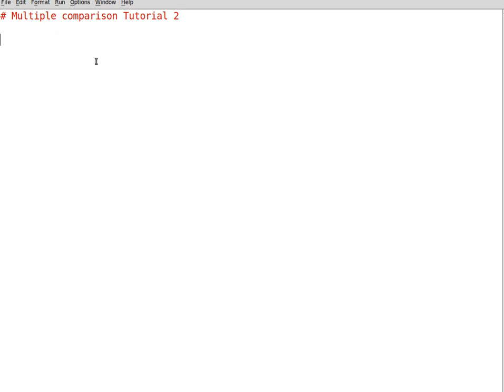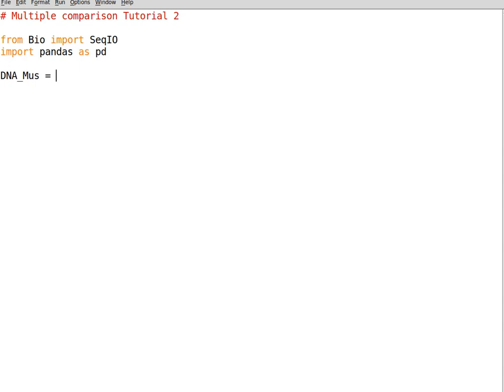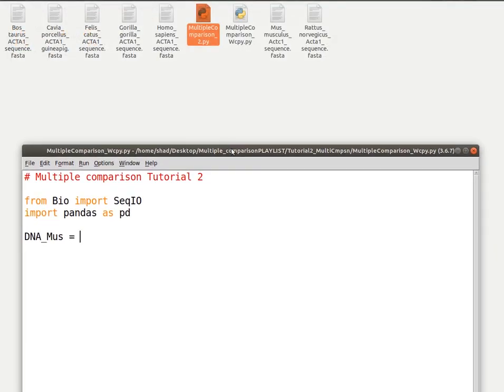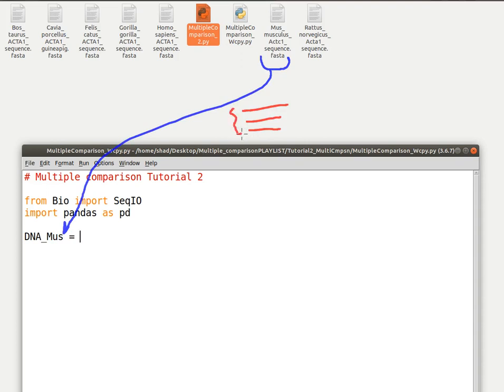For this tutorial we need to import BioPython, so we write: from Bio import SeqIO, then import pandas as pd. We declare a variable called dna_mus for Mus musculus, to contain the DNA sequences that have been downloaded, which also contain the intronic regions. This is the file which I'm going to parse and assign the data to this variable. The file contains a list of introns.